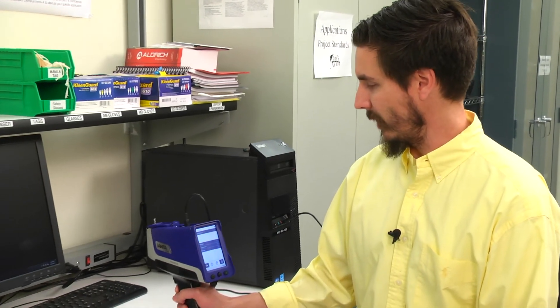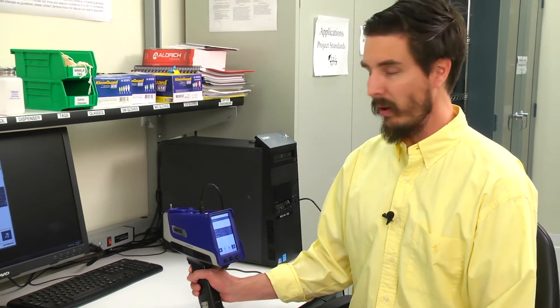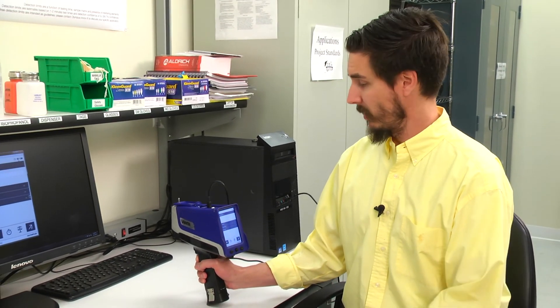Test times using a Vanta analyzer are all about balance. You want a long enough test time that you have the accuracy and precision, but you also want a short test time so you can test a lot of samples at once.